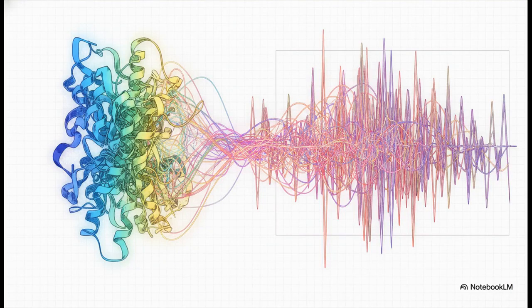So traditional 1D Fourier transform NMR, it's absolutely fantastic for small molecules. It gives you these perfectly distinct peaks for your functional groups. But there's a hard limit to how useful it is. When you start analyzing larger, much more complex molecules, we're talking big proteins, nucleic acids, complex polymers, you're naturally adding a lot more atoms. And more atoms mean more signals. In a single dimension, those signals just pile up right on top of one another. You get these overlapping resonances that make the whole spectrum virtually impossible to decipher. The data's all there, but it's completely hidden in the clutter.